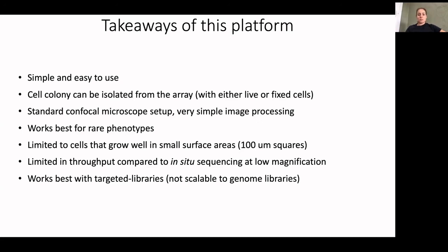So what we ended up doing was using a PCR-free hood to prepare these libraries so that we could use high numbers of amplification. So I think we did, in our 2-step approach, 22 cycles of amplification for the first round and like 10 for the second round. And so by doing that in a clean hood, we could do that very well without having contaminants. But when you do that in an open space, there were a lot of contaminants that came into play. So there's definitely some optimization that can be done to improve that step.